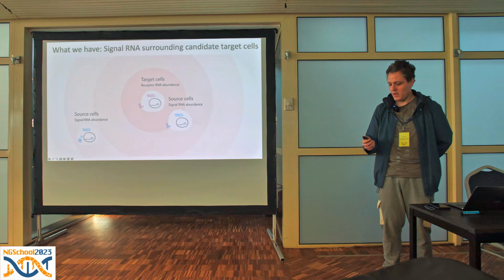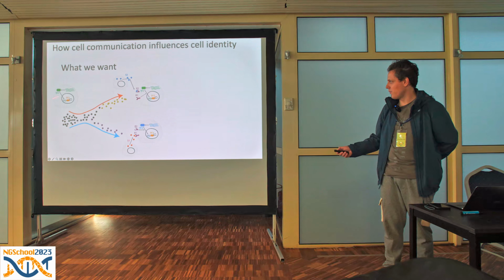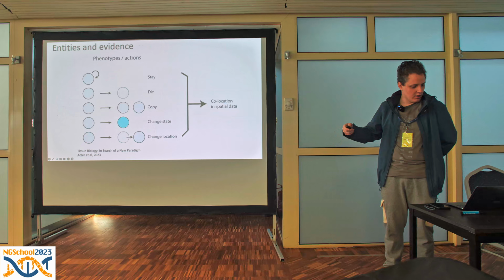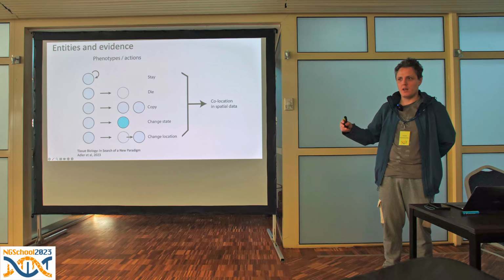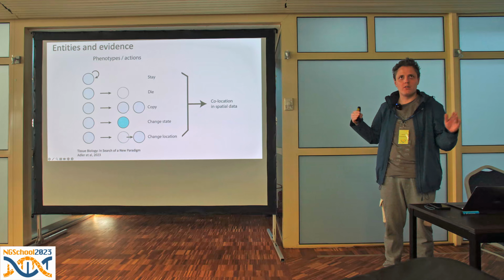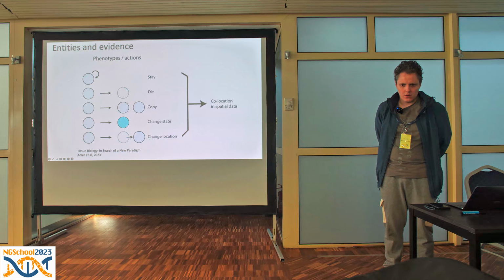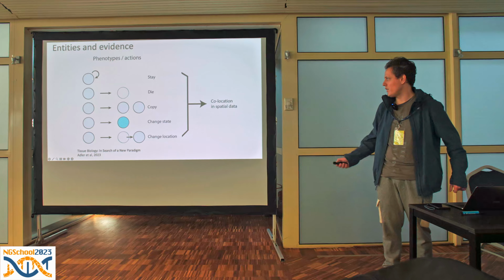But this is obviously limited, and you also still have the problem of disentangling phenotypes. We want to say that we can disentangle cell state change from all of the other options because we have a very constrained mechanistic model of cell state. It's constrained by DNA sequence, so not everything is possible. The problem here is that a lot of things correlate with a lot of things, and one of the references that I would recommend you to read is fantastic work from the Fabian Theis group by David Fischer. The method is called NCEM. I don't remember what the paper is called, but they discuss a lot of these computational modeling issues, including how you have to deconfound potential consequences.